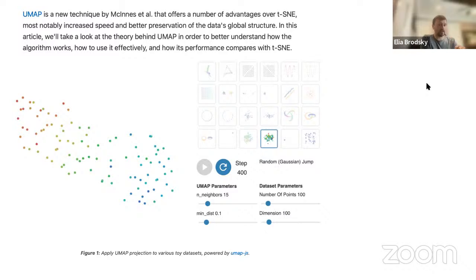The more complex the data, the more challenging it is to find the association between the data that we expect and the data that we get in the analysis results. But that does not make it wrong, right? We should base our assumptions not on what's intuitive, like visually this looks nicer. Instead, we should be looking for what we want to understand through this analysis as we try to get to some biological discovery or insight.